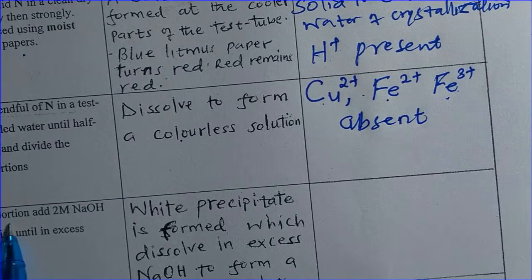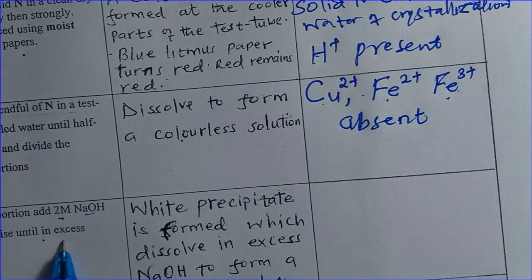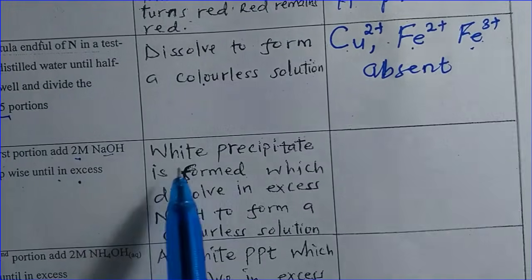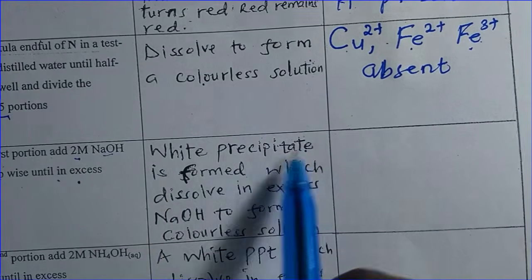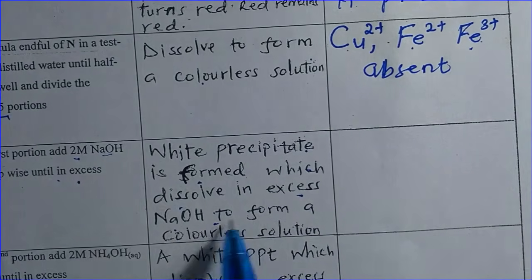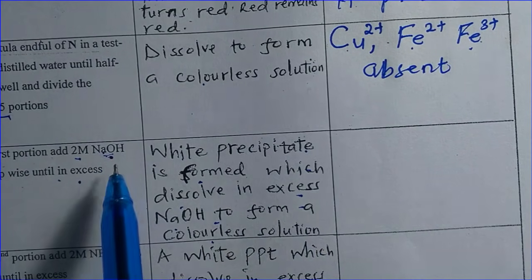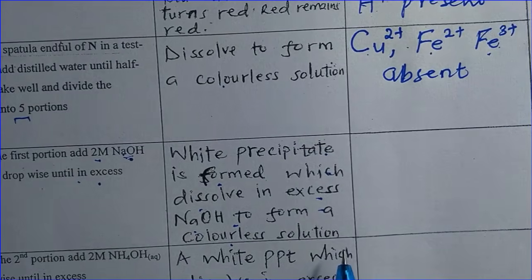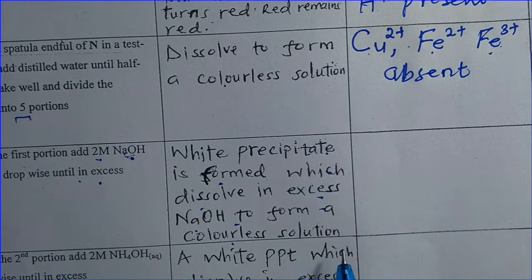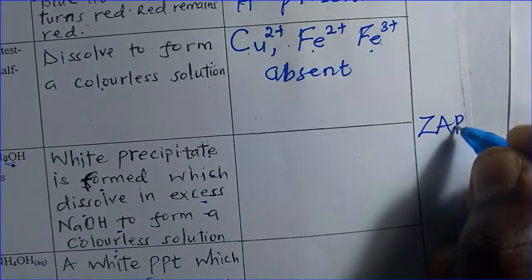To this first portion, add 2 molar sodium hydroxide solution, drop wise until in excess. The observation: a white precipitate is formed, which dissolves in excess sodium hydroxide to form a colorless solution. So sodium hydroxide will dissolve in the amphoteric ions only. The amphoteric ions we call ZAP.